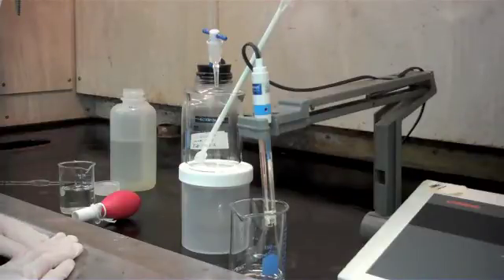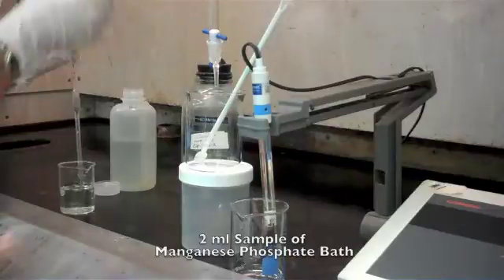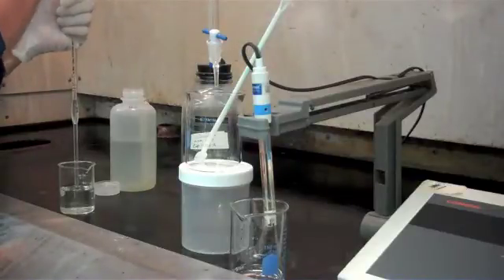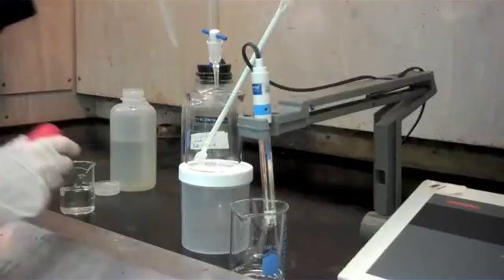With the pH meter you can get consistent readings from one test to the next. The first thing we're going to do is take a 2 ml sample of a manganese phosphate bath — or whatever the appropriate sample size is for the bath that you're testing — and place it into a clean beaker.